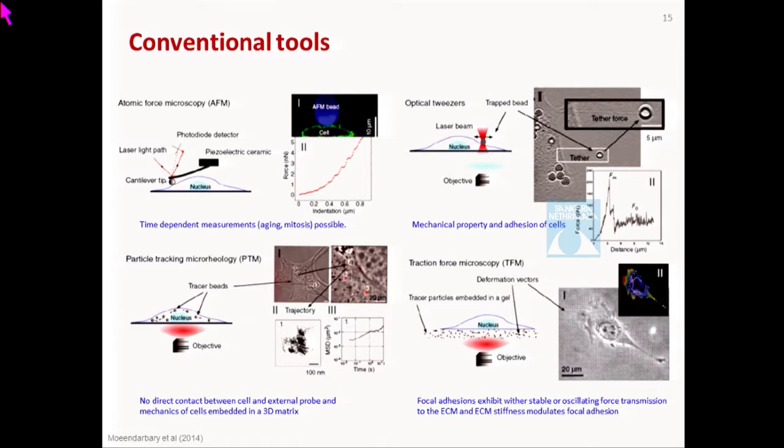As per optics, when you have a difference in refractive index, that leads to some kind of force. When you drag this light beam, the bead attached to the cell also moves because of this optical scattering force. And when the bead moves, the cell gets stretched. The stretching of the cell is quantified against the Young's modulus of the cells.